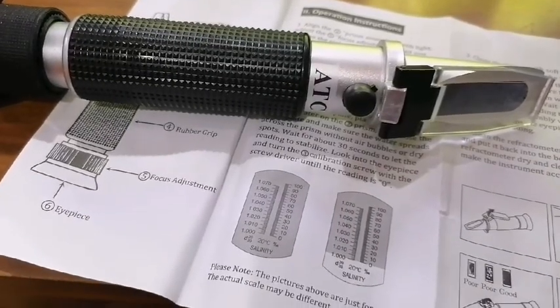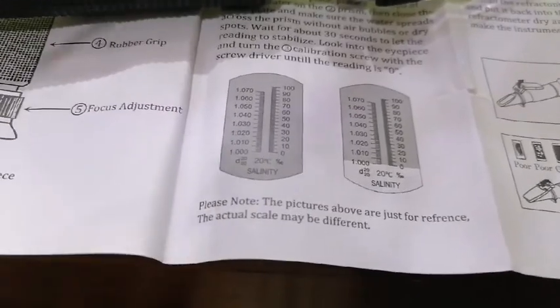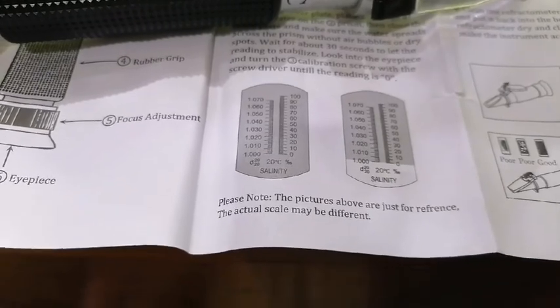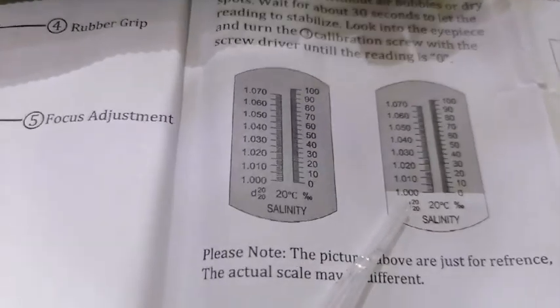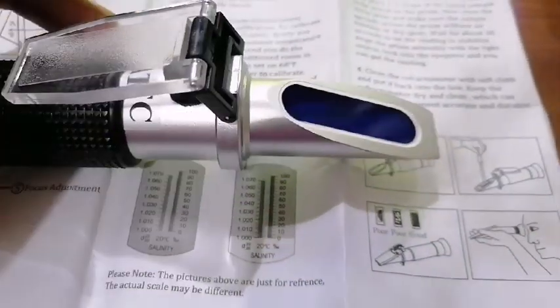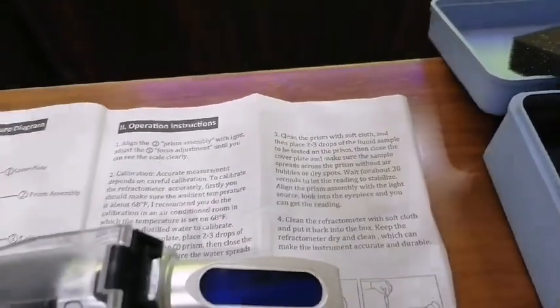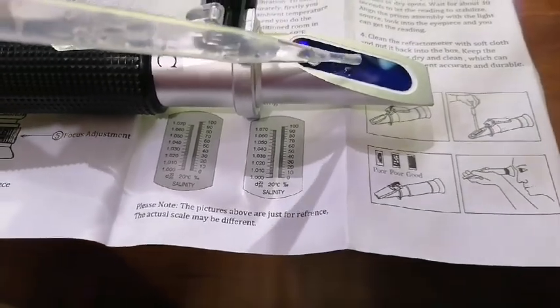For calibration purposes, you need distilled water. Here are two pictures showing how to calibrate. When using distilled water, the salinity should read 1.000 or zero. I'll show you how to calibrate. This is the prism, and on this surface you need to put some water drops. I am using distilled water right now and putting some drops on the prism — two to three drops are more than enough.